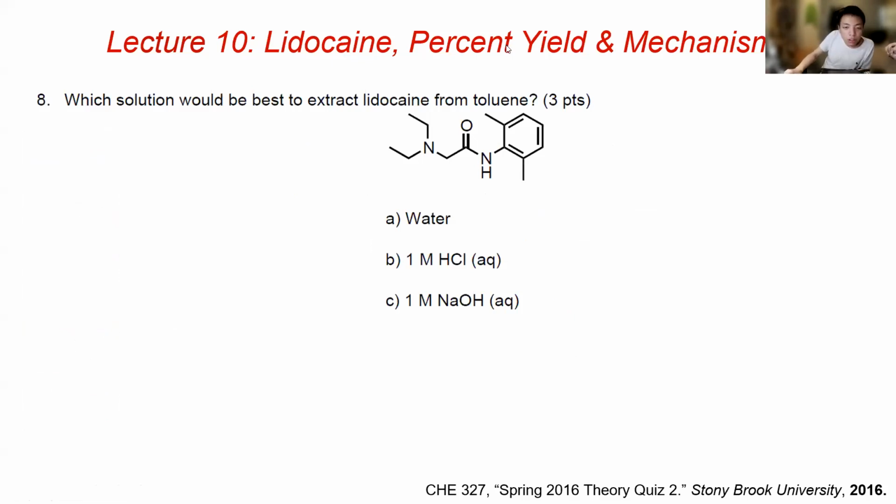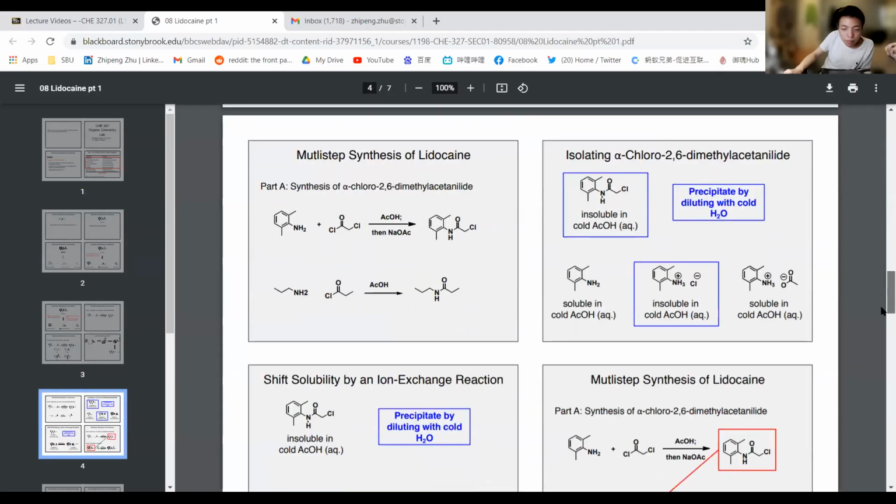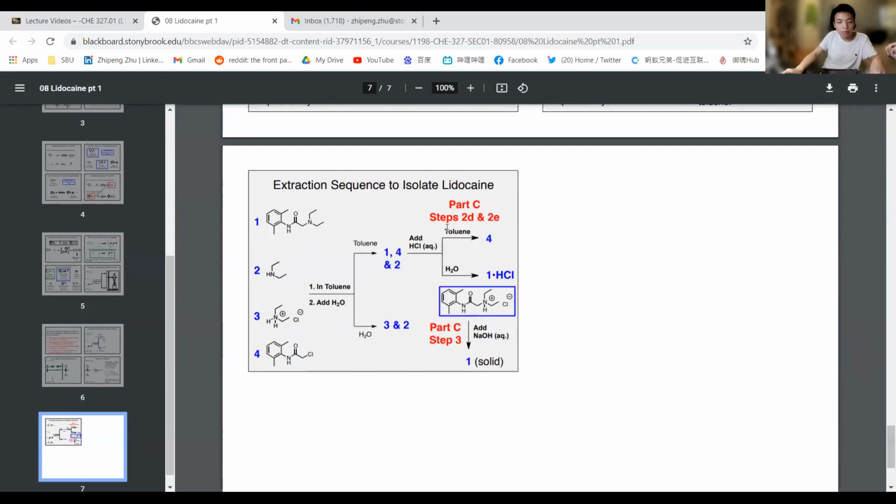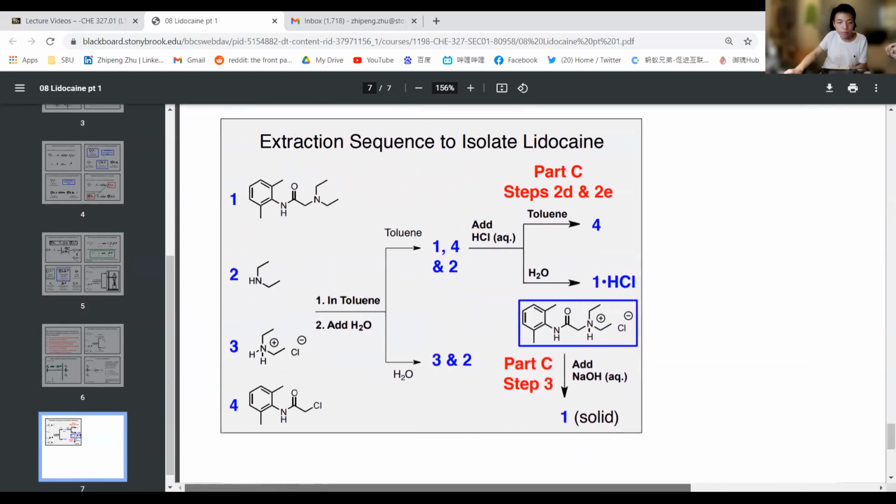So if you follow through the charts, I will use the lecture note actually. And the question asks what's the best solvent used to extract lidocaine. And here we use HCl.